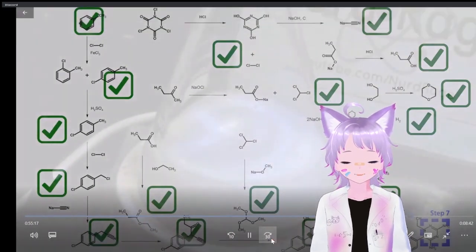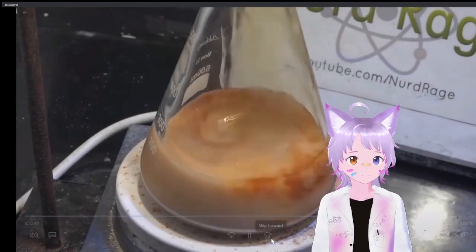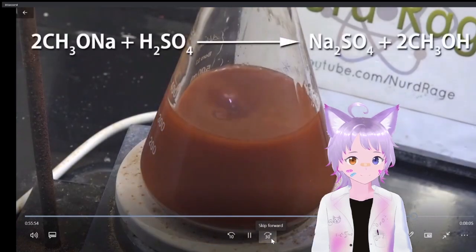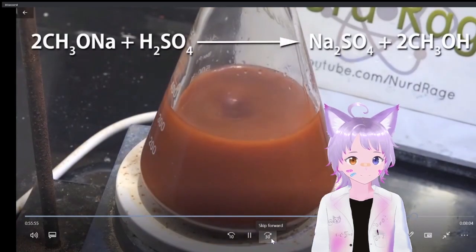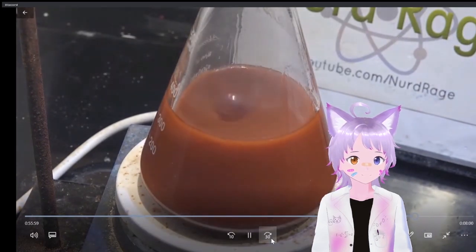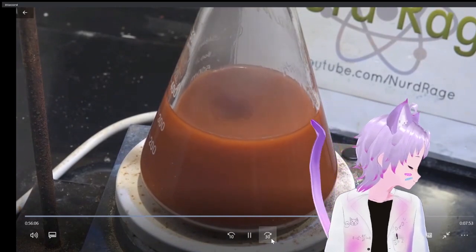We're approaching the home stretch. The entirety of our enol ether reaction mixture: the excess sodium methoxide will react with the sulfuric acid and turn it into sodium sulfate. The excess beyond that will flip the acidic conditions of the enol ether formation to the strongly alkaline conditions we need for the guanidine reaction.